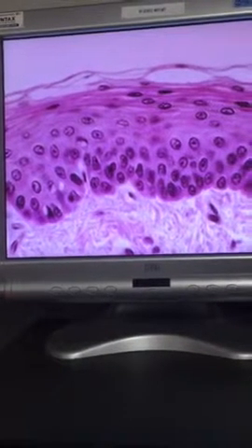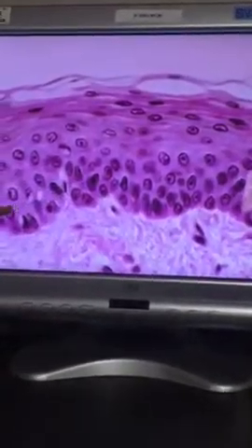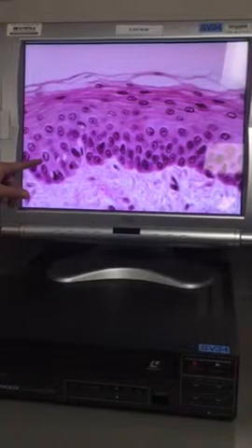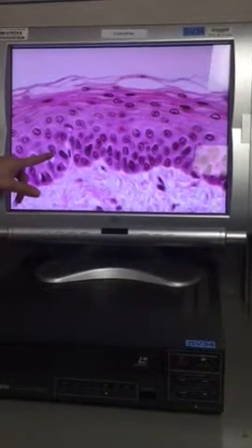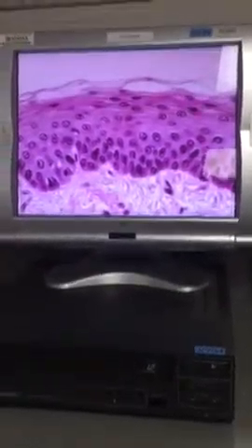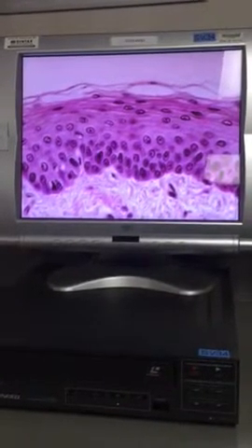Even beneath it, like the bottom part, is that also, right above it? Oh, here? So, yeah. This is part of the tissue. This is part of the stratified squamous. In stratified squamous, the deeper layers of cells are not squamous cells, really. They're more like cuboidal or what's called polyhedral, meaning they have many sides. But they become squamous as they go toward the surface. So it's named after the way the cells look up here. Okay, let's take a look at one more.